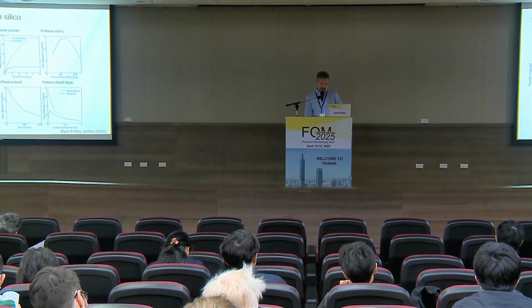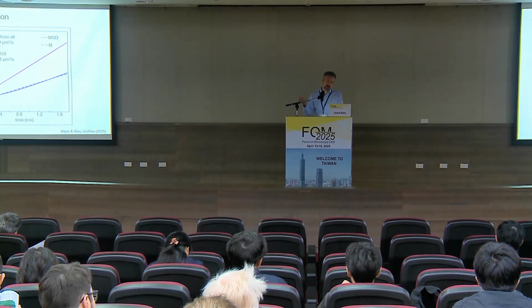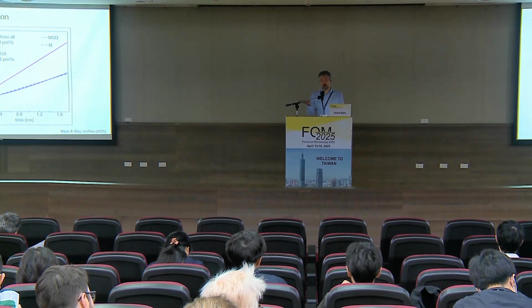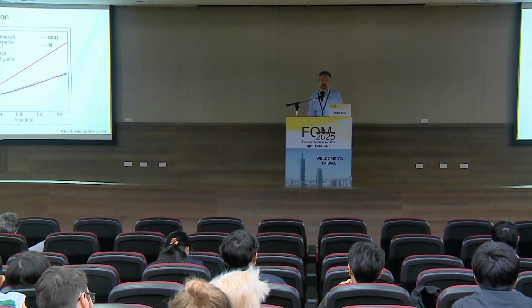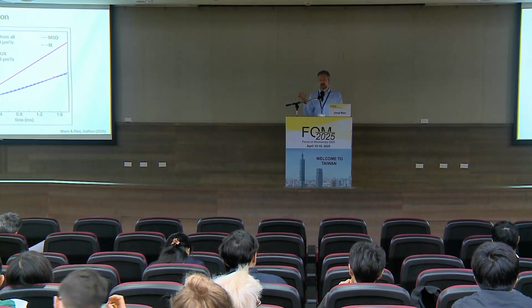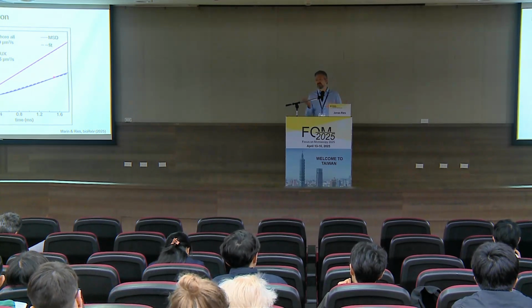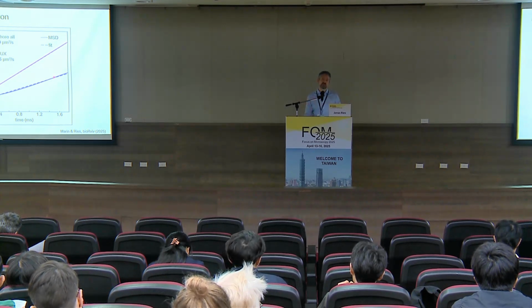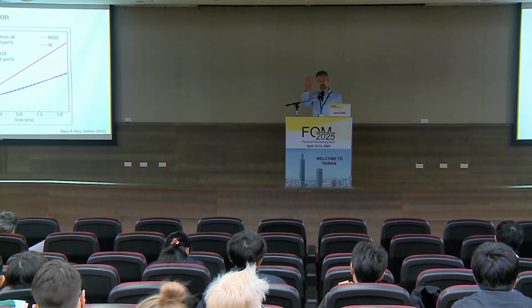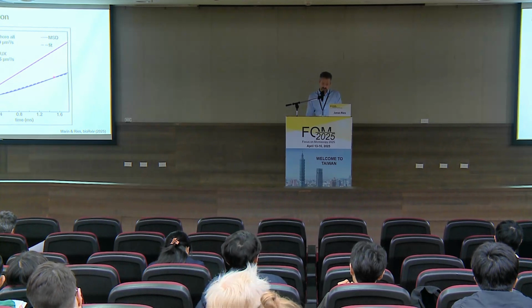But maybe, since I'm here, one point of caution. We found that if we are close to the limit that we can detect with MINFLUX, we have a strong bias towards slow diffusion. And also, the mean square displacement that we measure with MINFLUX is not linear anymore. So if you use this, for instance, to study membrane diffusion, it could mimic some kind of subdiffusion, even if it's not there, just because of the limited time resolution and the tendency of MINFLUX to somehow smooth out the positions. Yeah, so faster scanning is needed, it sounds like. Okay, thank you very much.